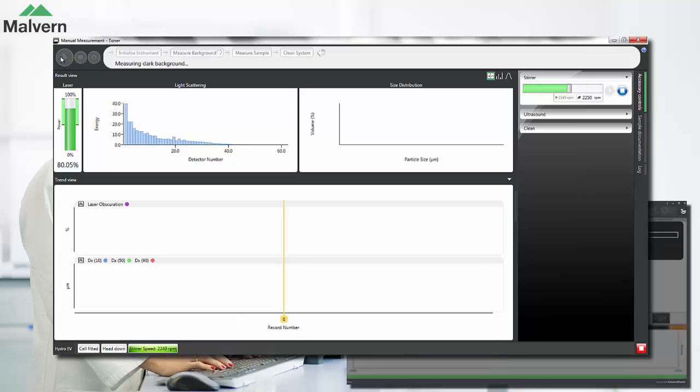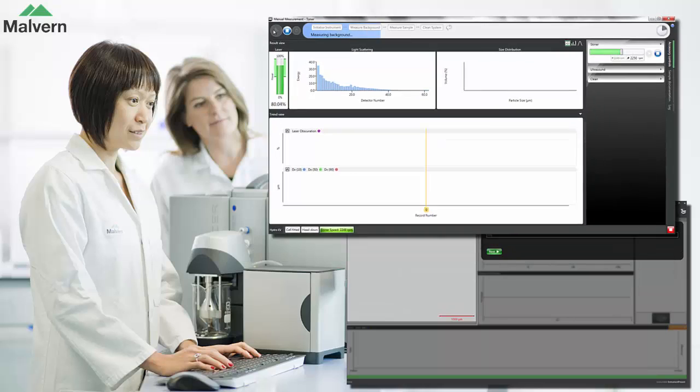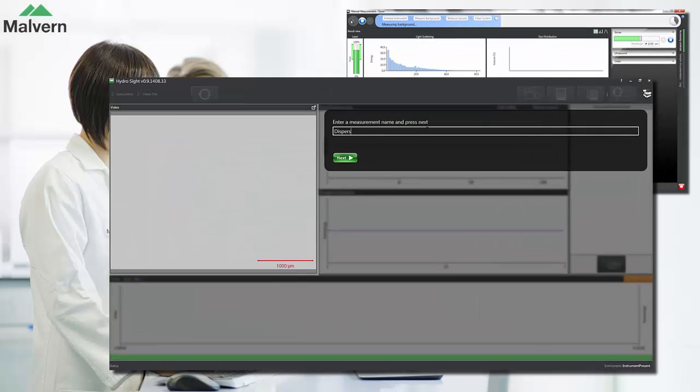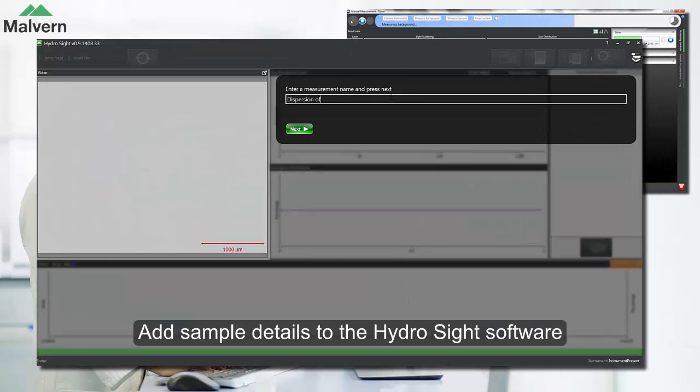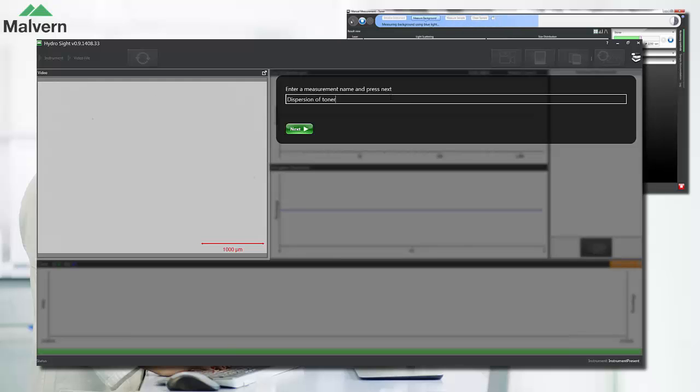We'll start with the MasterSizer measurement by running the alignment and background. We can then move to the HydroSight software and add some sample details. In this demo we're going to look at a dispersion of a toner sample.